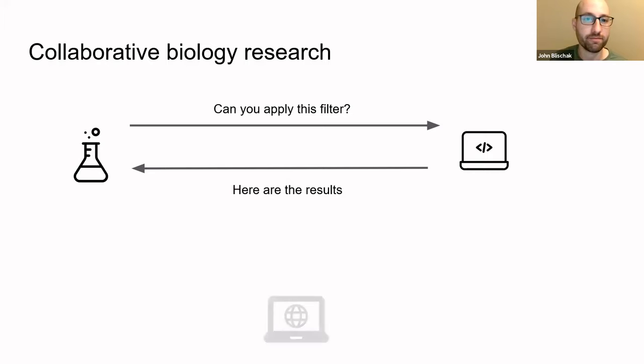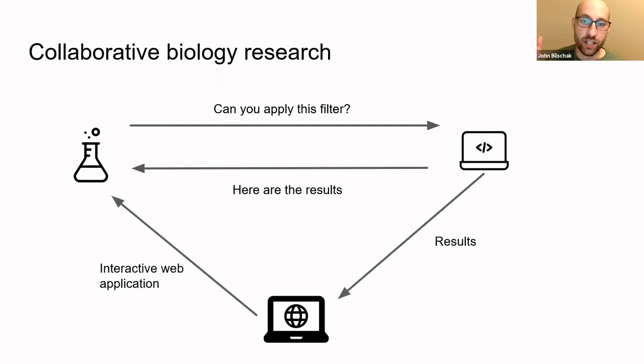analyzing new data. So at an organization like AbbVie, where we develop this software, there's a whole bunch of web developers that could help us out. And so the goal was that the bioinformaticians would give the results to a web application that the domain specialists could interactively look at any genes they want or apply different filters and only have to ask the bioinformaticians for very bespoke, customized analyses.